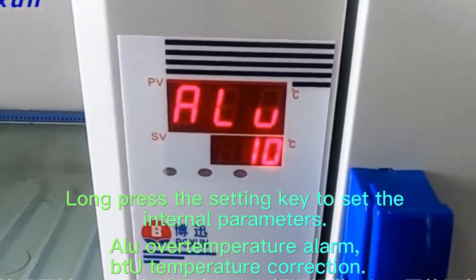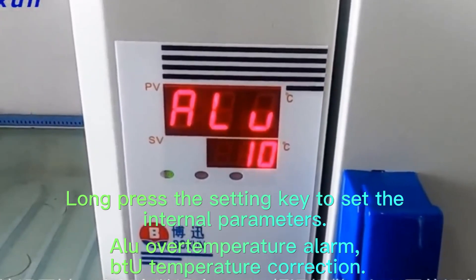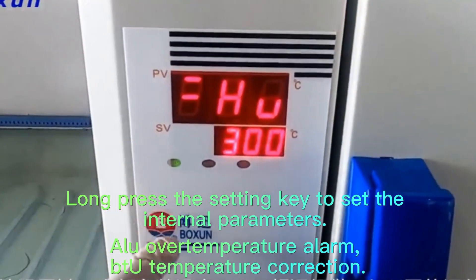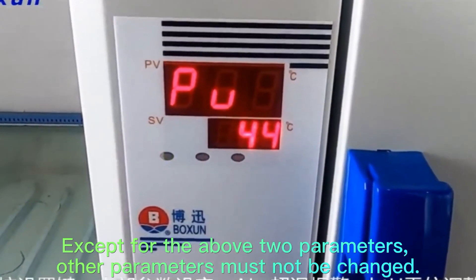Long press the Setting key to set the internal parameters, including over-temperature alarm and temperature correction. The other parameters must not be changed.